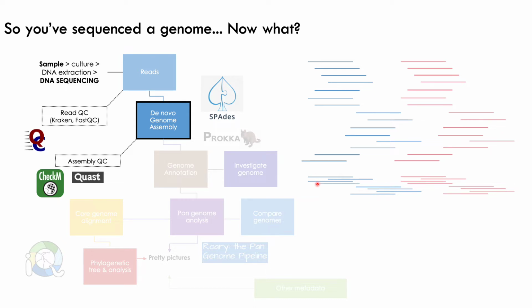We can see that the reads overlap at all of the positions, and our forward and reverse start to overlap as well, which is exactly what we want. So we have what's called contiguous sequence. So we assemble these into our first contig. So I've got a nice long contig here.